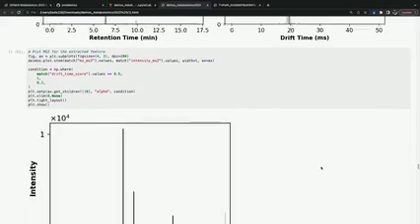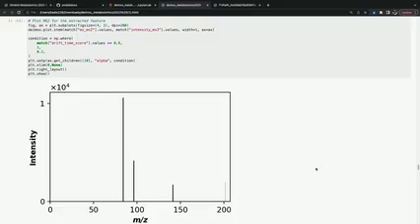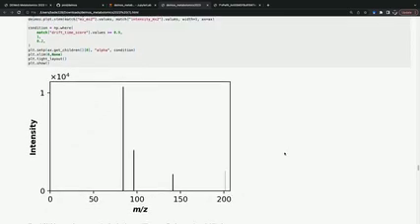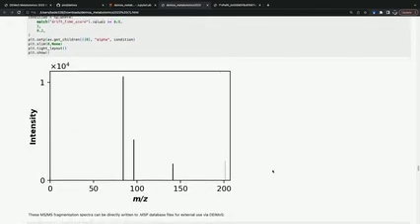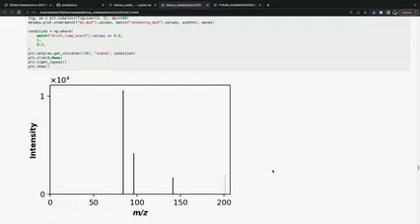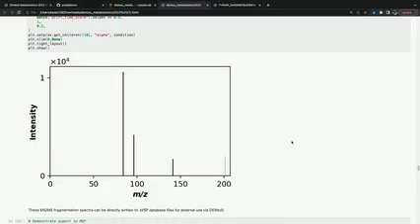And of course, we'll plot the MS2 for the extracted feature. Again, I've included color encoding by the drift time score that's determined by deconvolution. And so we get this fragmentation pattern. It's not shown here, and DEIMoS doesn't include scoring utilities, but actually we looked in MONA for this, and the fragmentation spectrum for phenylacetylglutamine corresponds pretty well to this fragmentation spectrum. You can draw in scoring utilities such as cosine scoring and score those against existing databases.